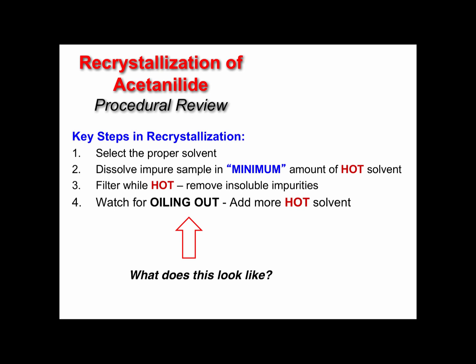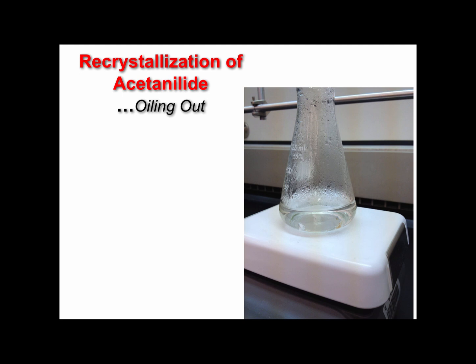In this case, the solvent is behaving like an impurity, and therefore the melting point really drops down for acetanilide. So you still continue. Once it melts and you have oily droplets, you need to keep adding water at the boiling point to get those all into solution.